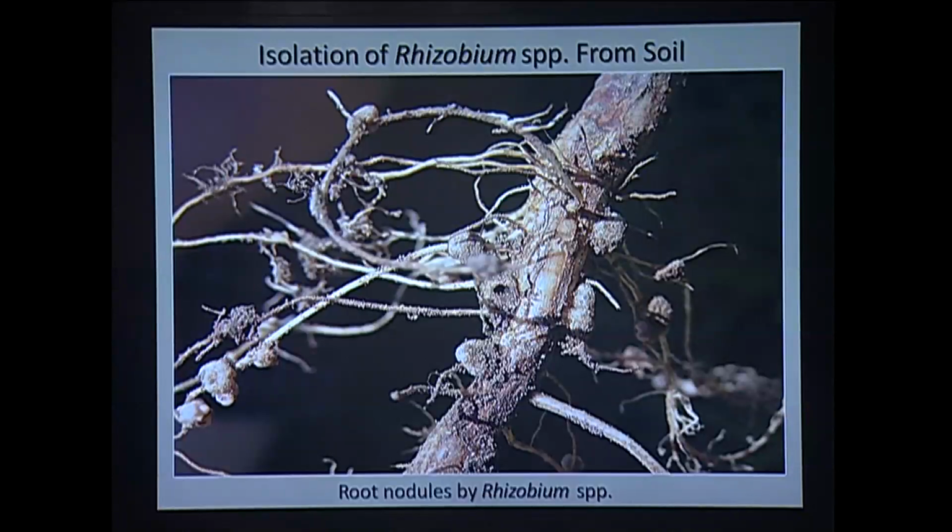We have already understood that Rhizobium remains present in the nodules as well as in soil. Isolation of Rhizobium from nodules is easier and often gives better results, yet we are moving on with our experiment to see how we can isolate these from the soil. Why is it easier to isolate Rhizobium from the nodules than from the soil?